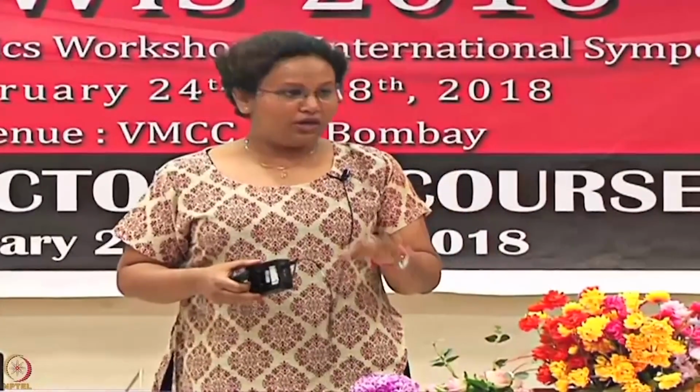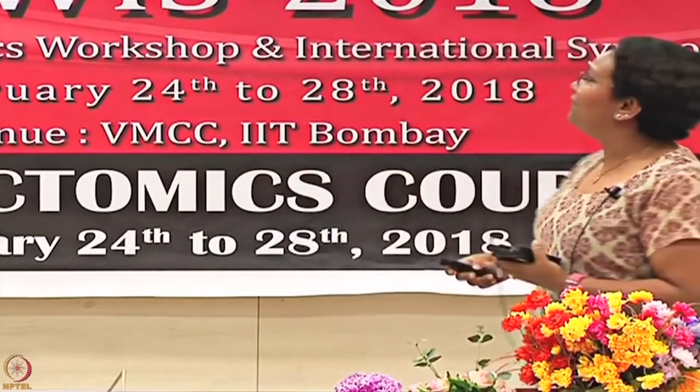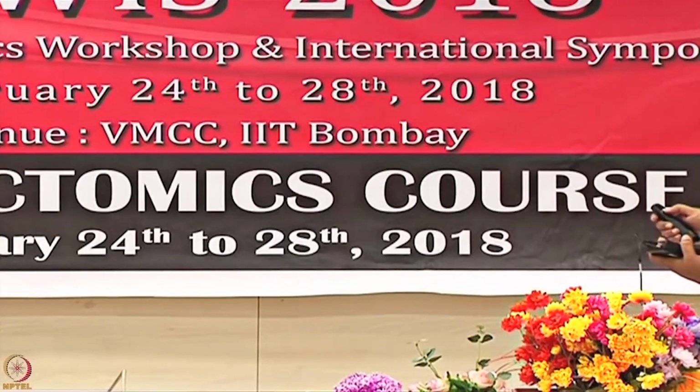Purity. The most pure one should go as a ligand, you cannot have an impure ligand. The more junk you immobilize, the dirtier the data becomes. You can still use an impure one as an analyte, so of course, when I talk about analytes being impure, it is only limited to applications like binding experiments. If you have to do kinetics, you cannot afford to have an impure analyte, but if you are doing a concentration analysis, if you are doing a binding, it is fine to have a slightly impure analyte.